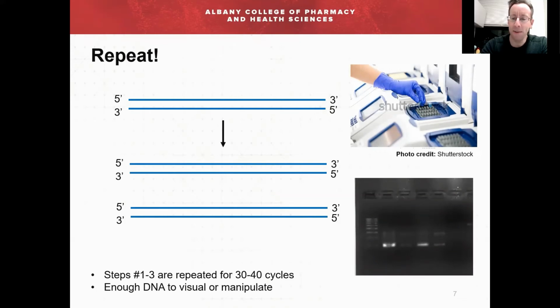Now, as I mentioned, this process requires temperature changes and cycles, so we can't run from a water bath to water bath to water bath. We need a better way to do this, a more efficient way. And as this image shown here, this is what's called a thermocycler.